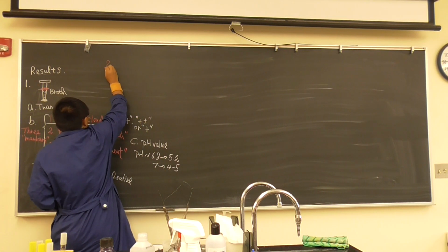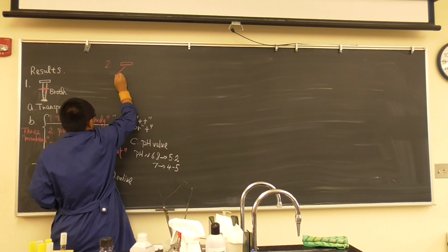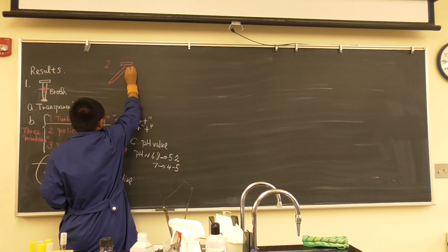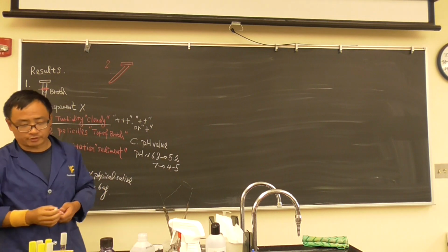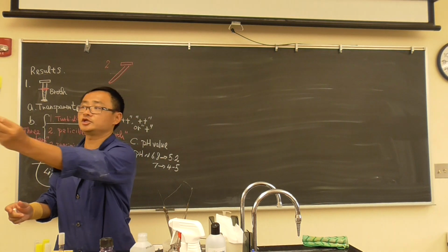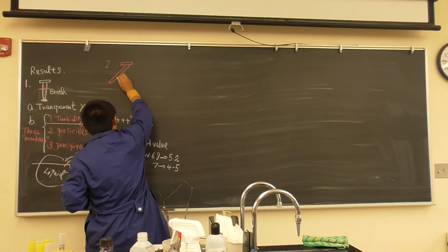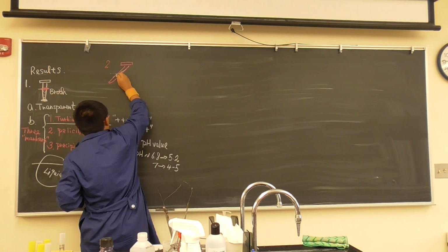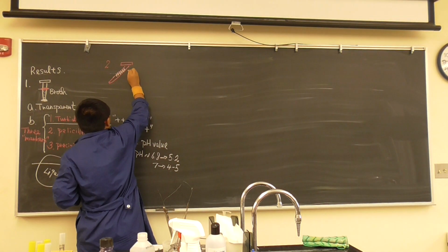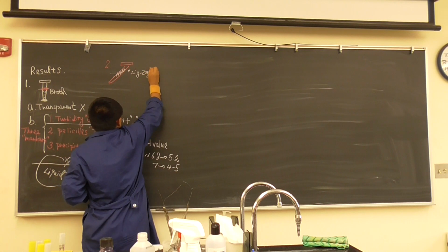Second thing is easy. You guys have a slant. And we say it is a temporary storage. I did already. Look at that. It's a zigzag marker. You should have the same thing. If the bacteria grow there, you see a very clear zigzag marker.